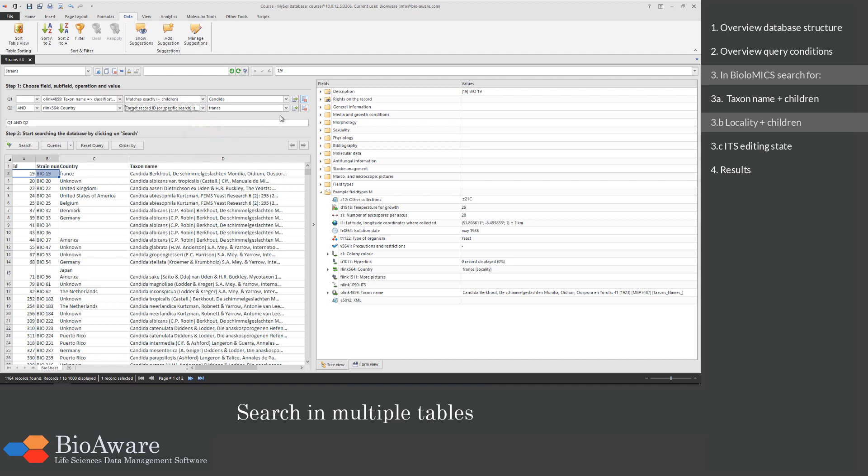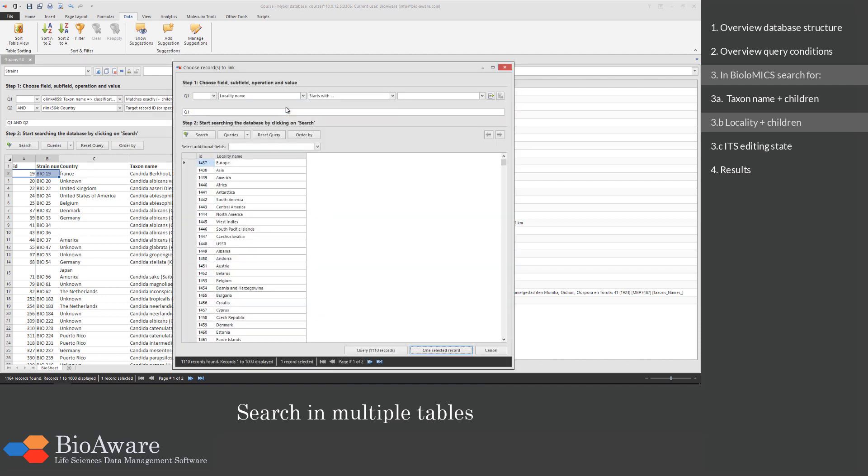When we click on the arrow, the pop-up appears with all the records of the locality table.